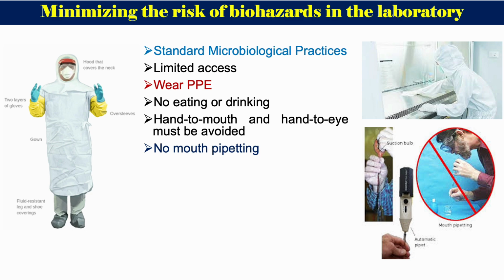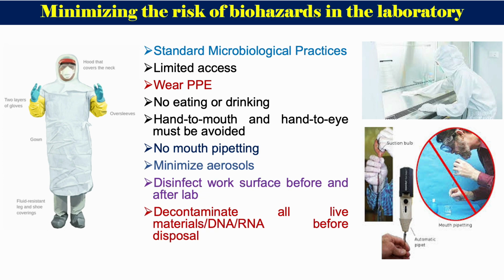You should not do mouth pipetting. Try to minimize the aerosol. Try to disinfect work surfaces before and after lab, and try to decontaminate all live material, especially DNA, RNA, before its disposal. So these are the points we have to remember to minimize the risk of biohazards in the laboratory.